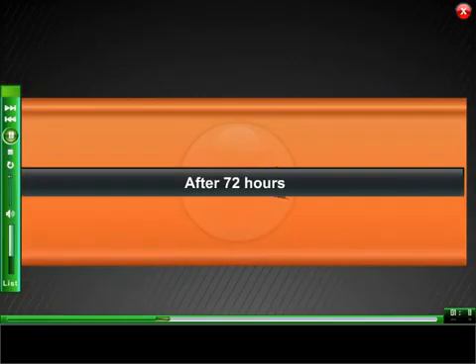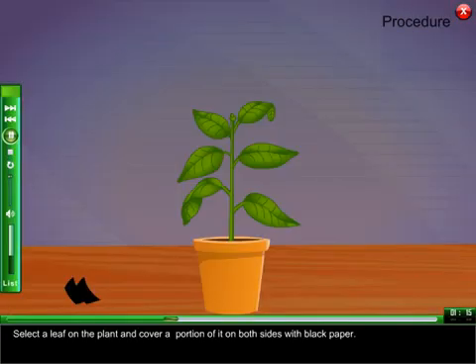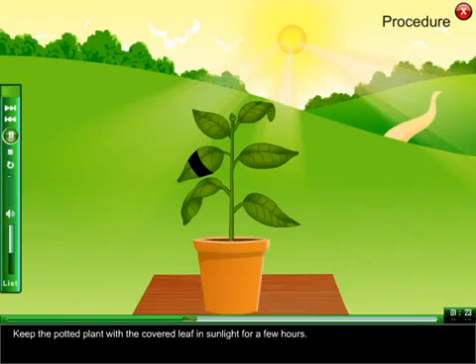After 72 hours, select a leaf on the plant and cover a portion of it on both sides with black paper. Keep the potted plant with a covered leaf in sunlight for a few hours.